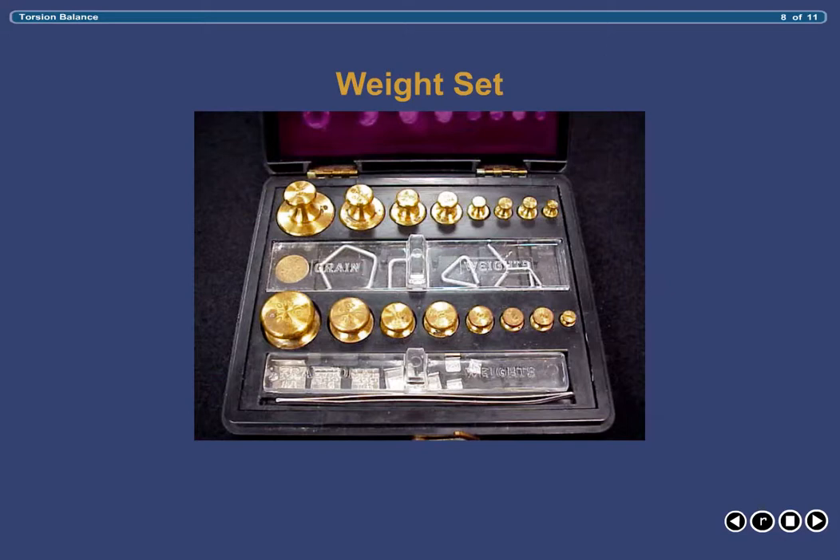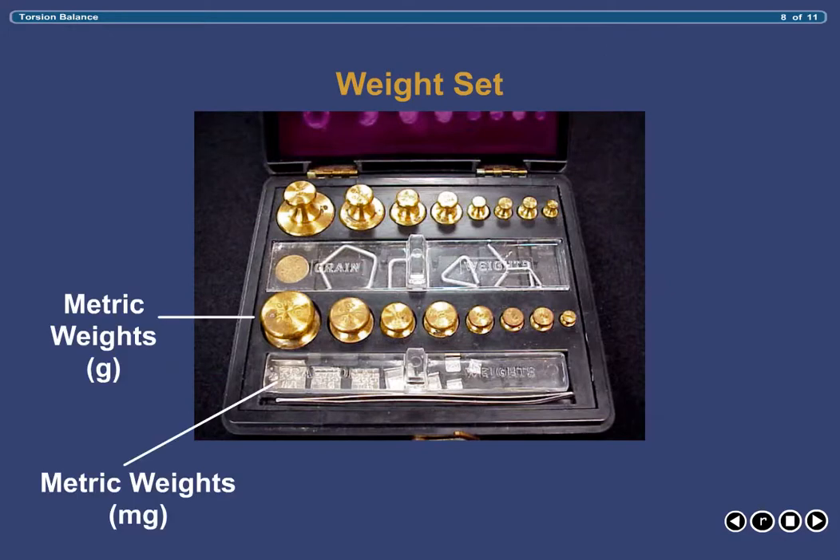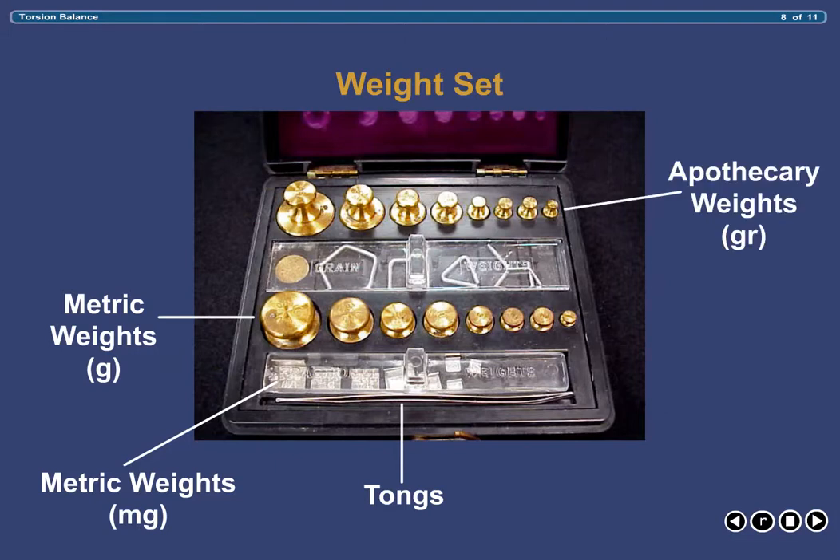Your weight set contains various metric weights ranging from 10 milligrams all the way up to 50 grams, plus a pair of tongs used for handling the weights. Weights will be added to the right-hand pan when a weight of product in excess of one gram is desired. For any desired weight less than one gram, the weight dial will be used. The use of tongs when handling the weights is extremely important in order not to contaminate the weights and thereby preserve their accuracy. Apothecary weights expressed in grains are also available in most weight sets, but are rarely used.